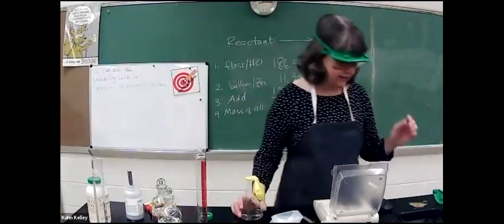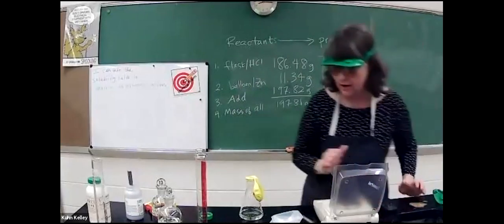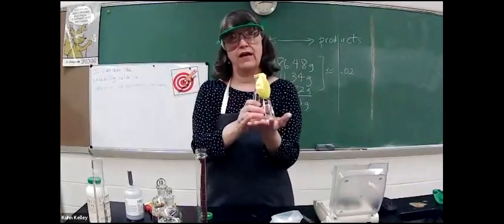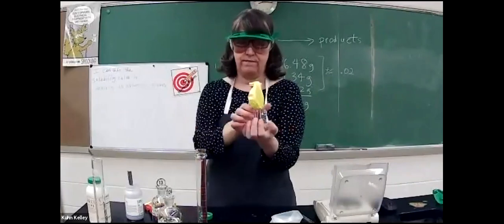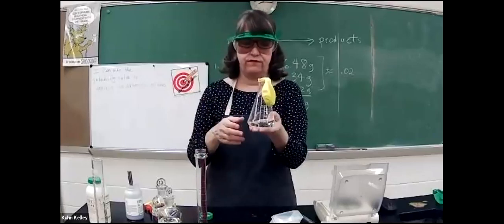So I have now done steps 1, 2, and 3. So what I'm going to do now is I want to feel my temperature beforehand. So if I feel this, I'm kind of getting a sense of its temperature. It's just a little cooler than room temperature. It's not warm at all. So it's just kind of a room temperature feel.